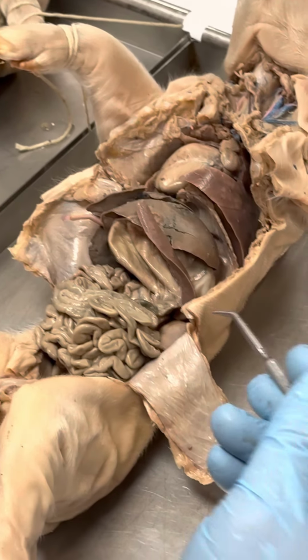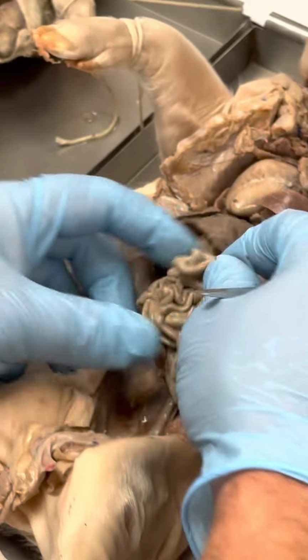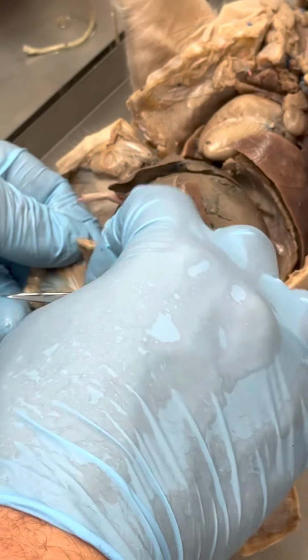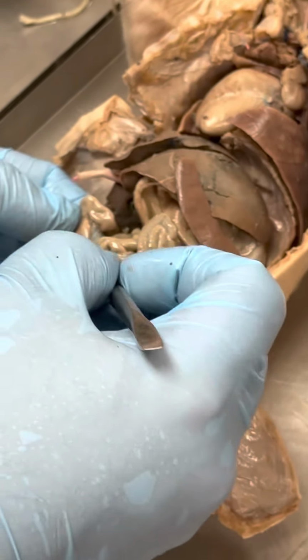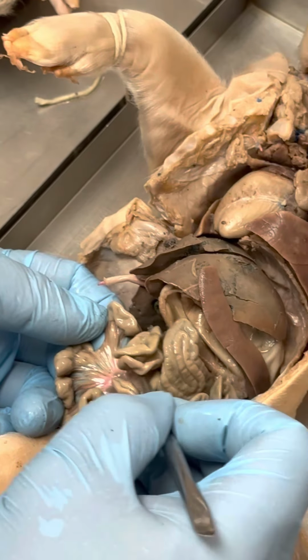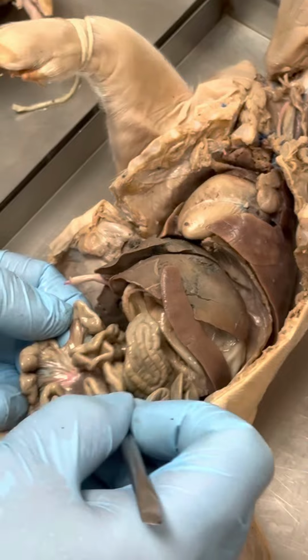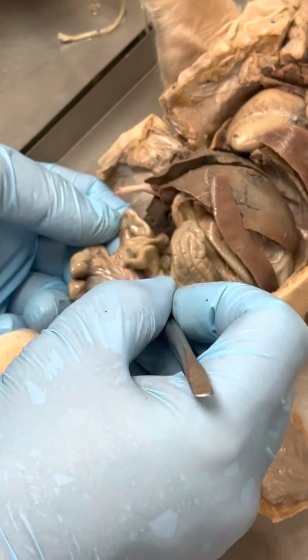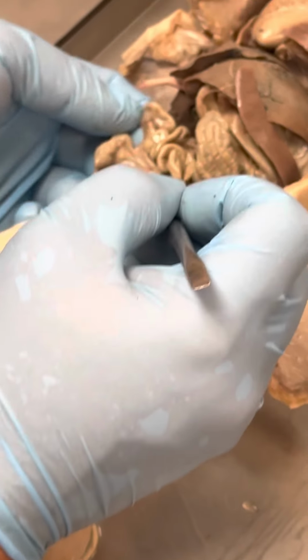What else we got? Mesenteric. So we go into this small intestine. Ooh, it's pretty. Then we're going to open it up. And all of that, that's all mesenteric. These are really branches of the mesenteric, but again, in A&P, we can pretend a little. These are like your arches or something like that. So it's mesenteric.